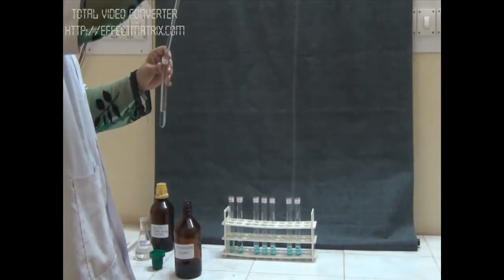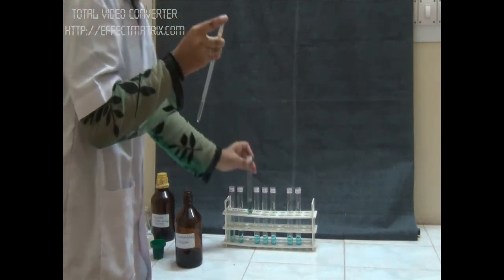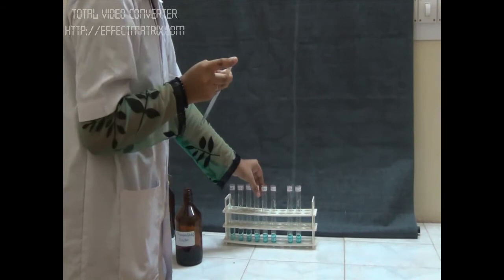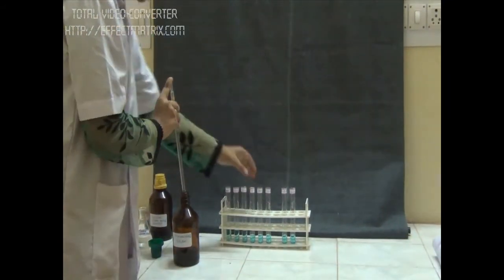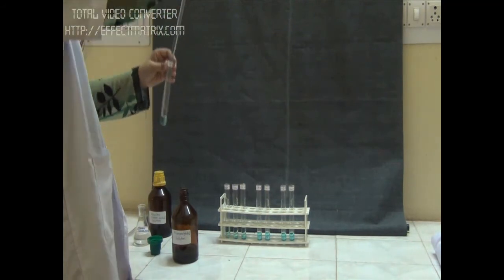Now in this way we are going to add arsenomolybdate solution to all the tubes, and after that we are going to incubate all the tubes at room temperature for 10 minutes. Now in this way we are going to add our reagent in all the tubes.